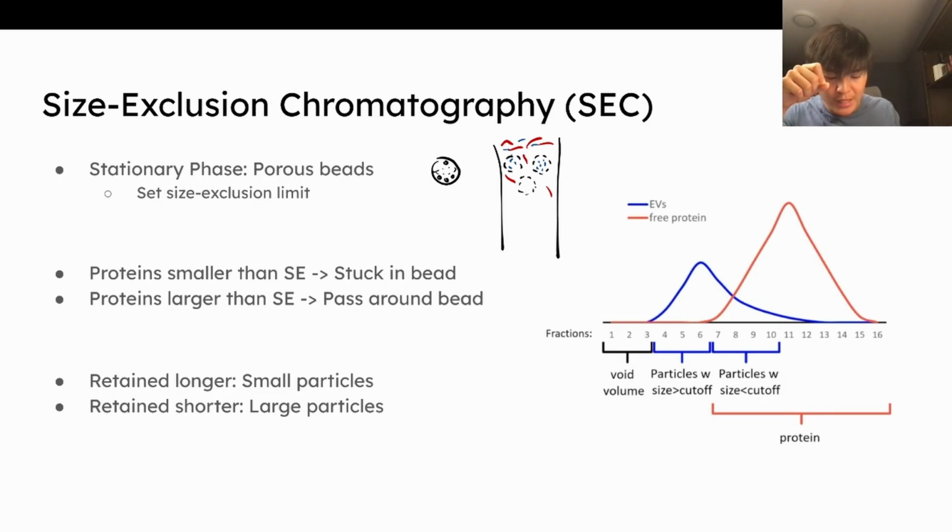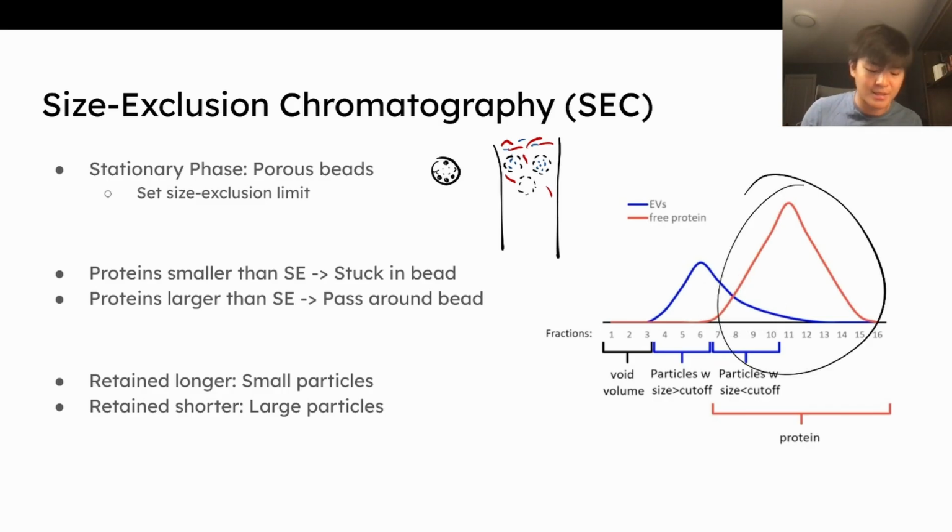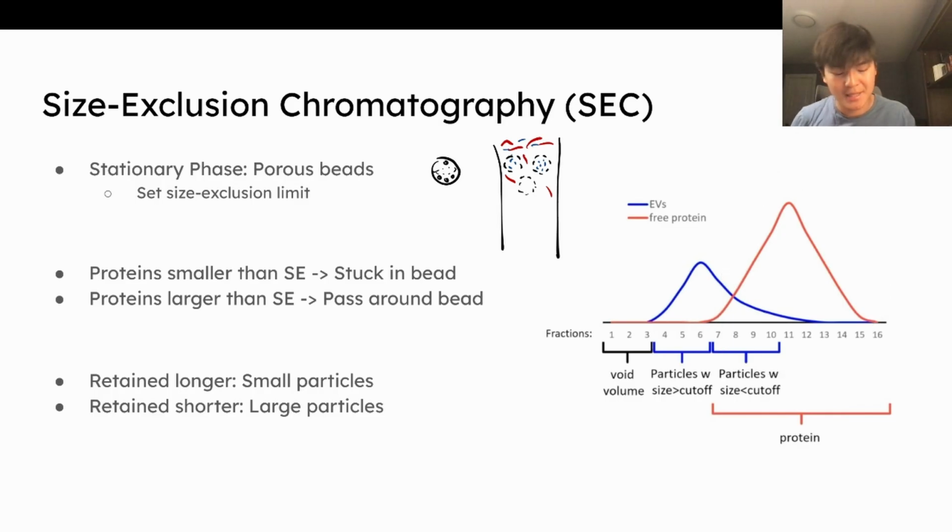This will minimize the probability of cross contamination. In other words, it just makes the fractions longer. It'll take longer for these small proteins to leave. The only caveat, especially with decreasing pore size, is that obviously you're not filtering your protein nearly as well, right?